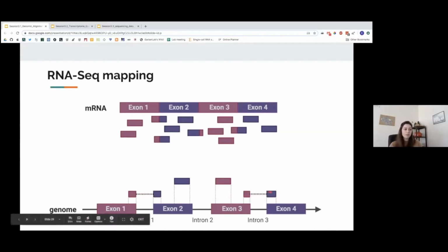And another possibility is that you can perform that alignment using a transcriptome reference. So this is something you're going to do today too when you use the RSEM program for RNA quantification. That program is actually in the backbone using the Bowtie aligner, and it's mapping your reads to a reference transcriptome. So what is a reference transcriptome?